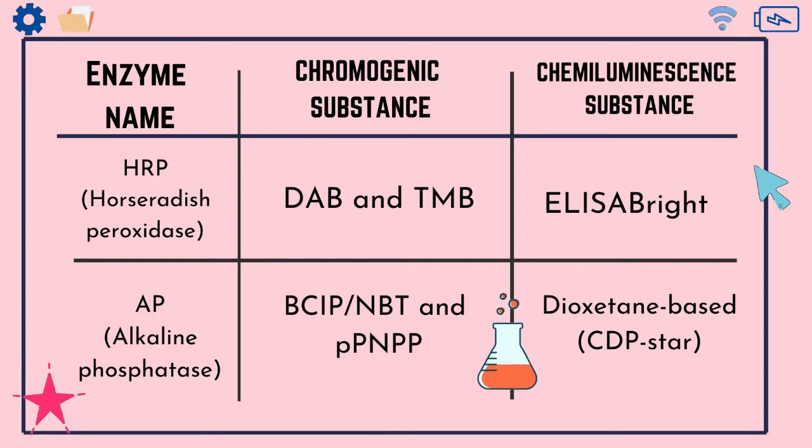Chromogenic substances are peptides that react with the proteolytic enzyme under formation of color. They are made synthetically and are designed to possess a selectivity similar to the natural substrate for the enzyme. The chromogenic substances for HRP are DAB and TMB. DAB is diaminobenzidine, used in membrane ELISA procedures as a precipitating substrate for the detection of peroxidase activity. DAB is the substrate of choice because it produces an intense, easily observed brown stain.